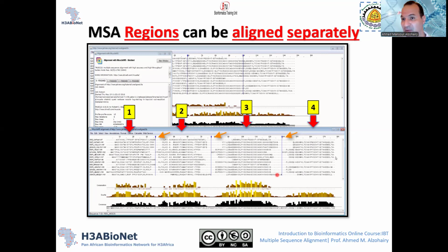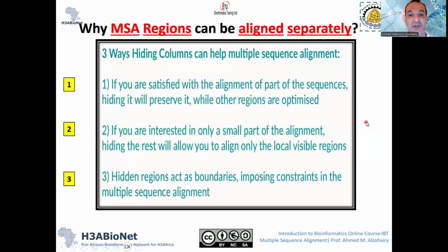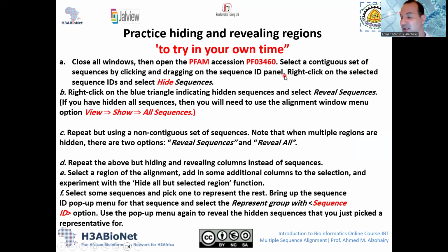So this is a very important and very good way to do it, and to represent them here, as you can see, in your paper. I hope you can get the benefit and use this one. And of course, each one of them will be separate, and this will be a very good presentation for whatever you would like to represent in your paper.